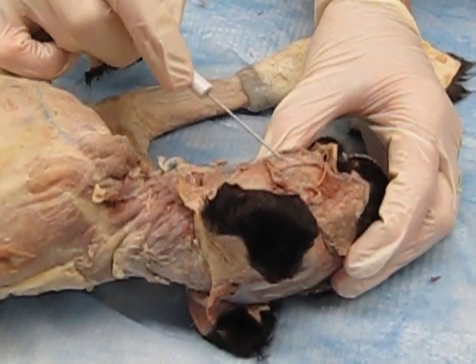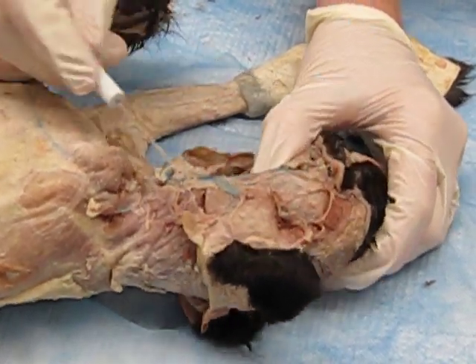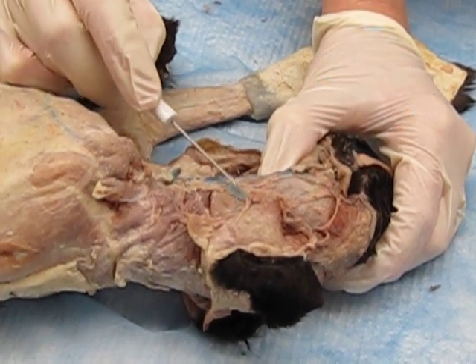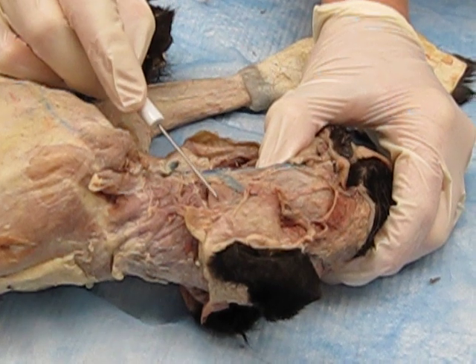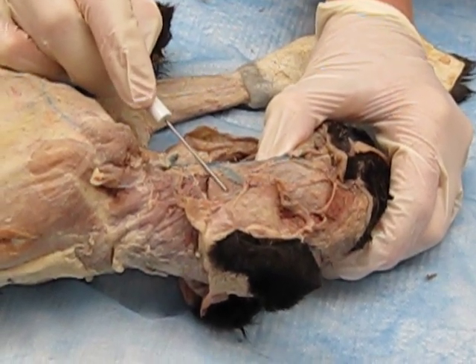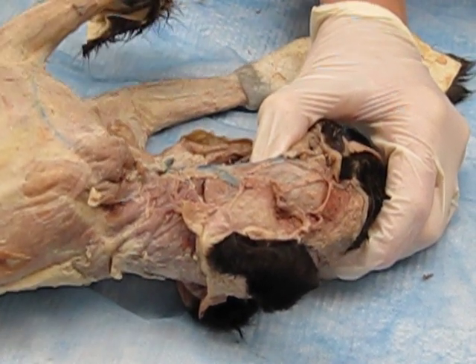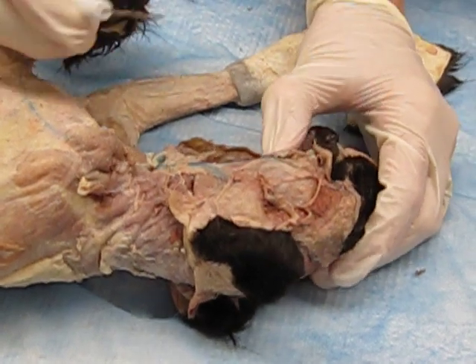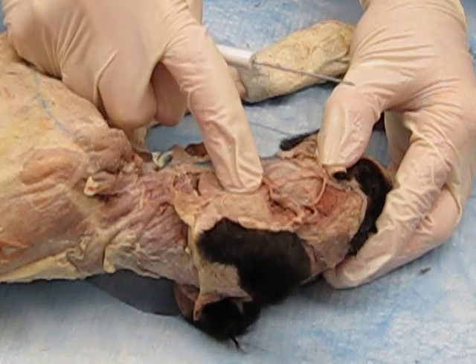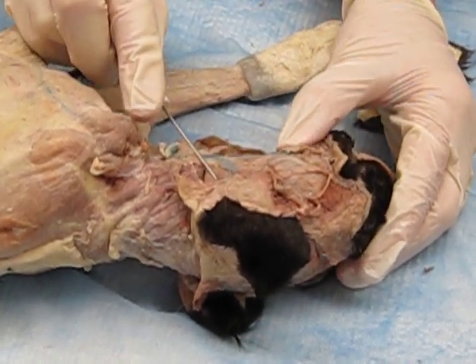What's this big, thick muscle? Masseter muscle, okay? Masseter muscle. This gland, which is underneath the vessel coming off of the jugular vein, so it's buried in your cat, so you're going to have to dig it out, is the mandibular salivary gland. And where's the mandible? What is it? The lower jaw, right? The lower jaw arcade. So that should tell you that here's my lower jaw, comes up over here, it's right underneath it. So that should give you direction on where to locate this structure.